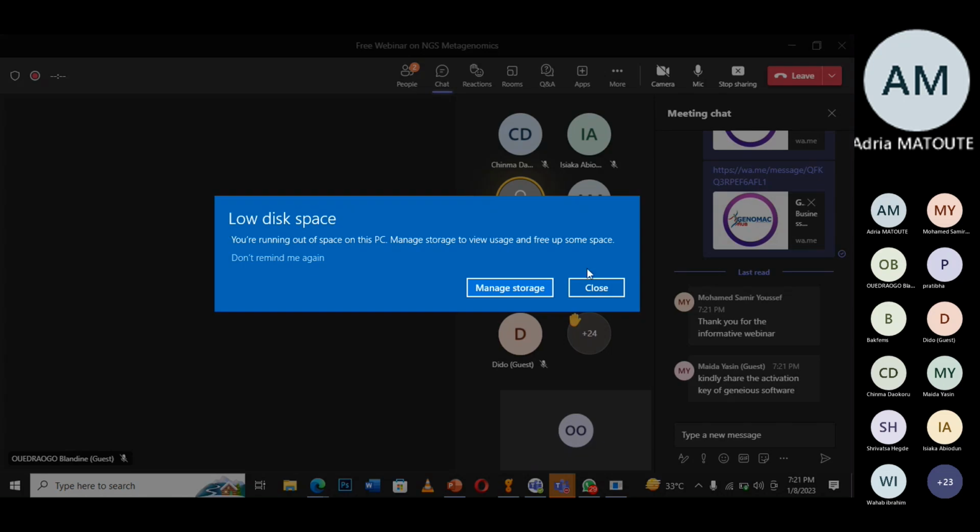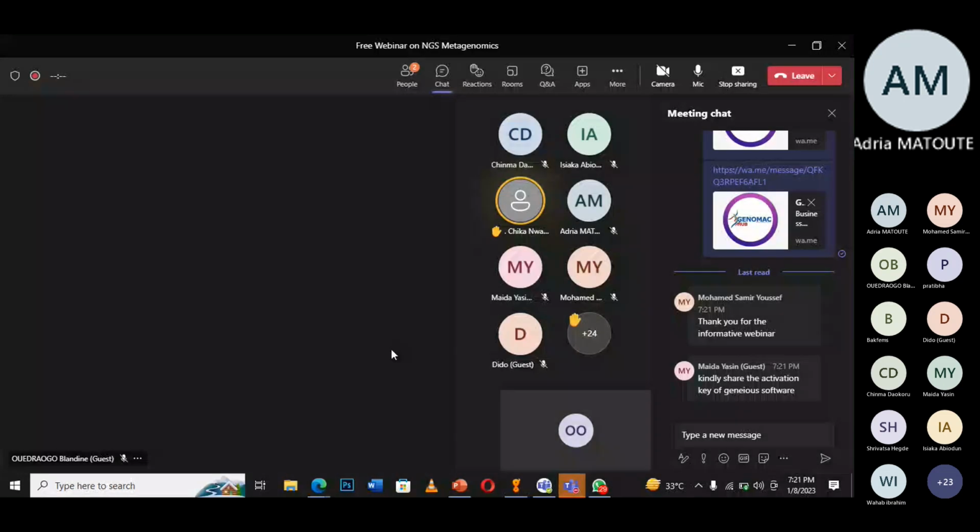Okay, let me ask. Hello? Yeah, I'm here. So let me ask you, is it 16S or shotgun? Yeah, 16S RNA. 16S.